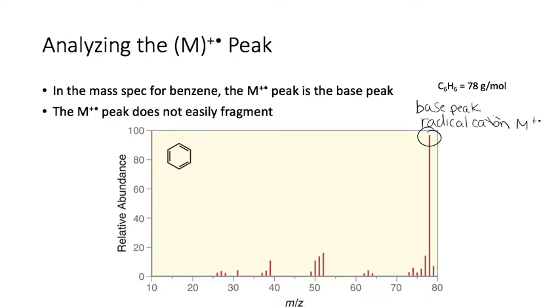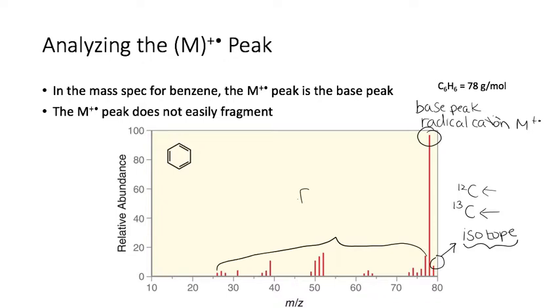This peak that's off to the right is an example of the isotope features here. Remember, carbon-13 and carbon-12. Carbon-12 is the most abundant, but you still have carbon-13. So that gives rise to a heavier isotope, not necessarily more abundant, but heavier. And then all of these peaks down here are going to be your fragments. Notice that you don't have as much fragmentation. The fragments down here are just not as heavily in abundance as the other components.